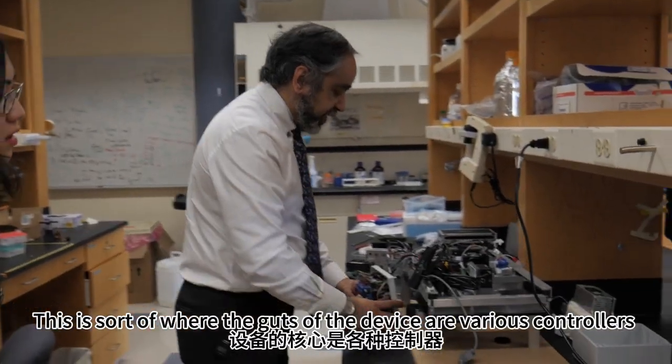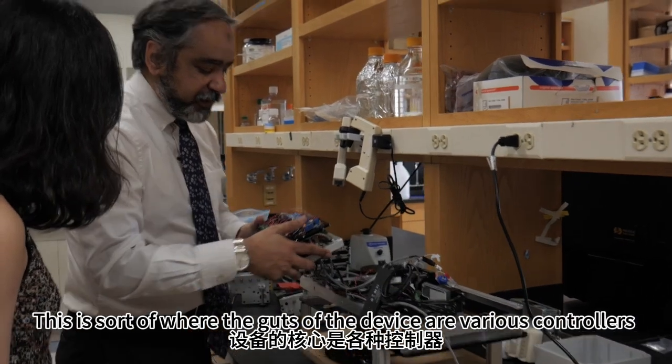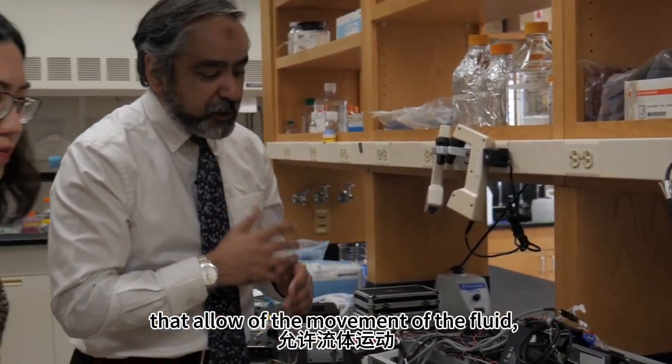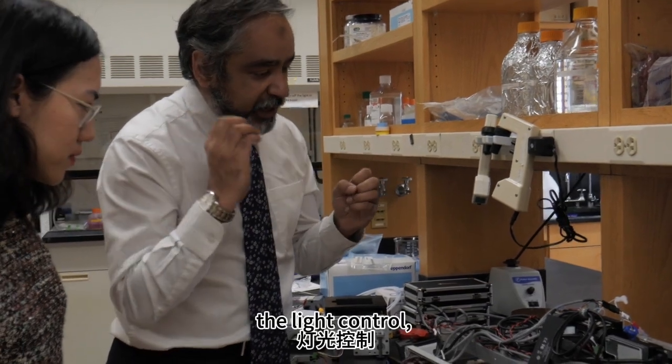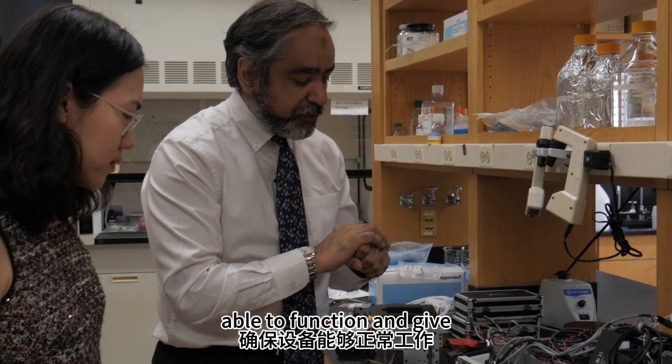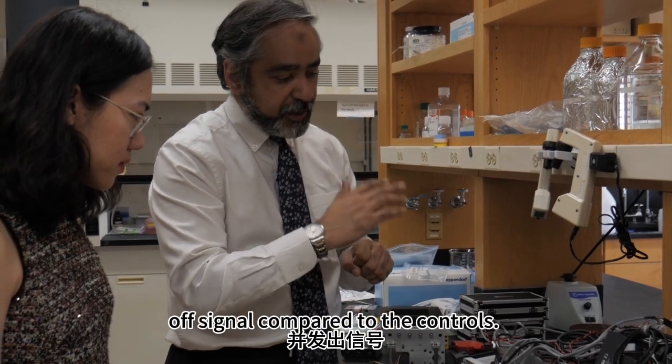So this is where the guts of the device are: various controllers that allow the movement of the fluid, the light control, making sure that the device is able to function and give off signal compared to the controls.